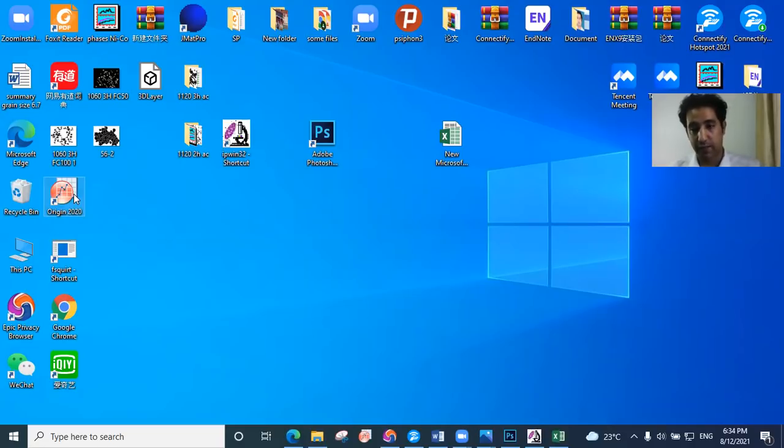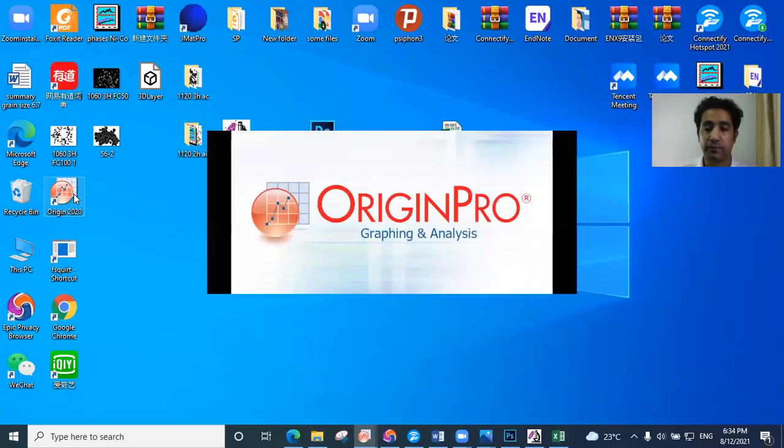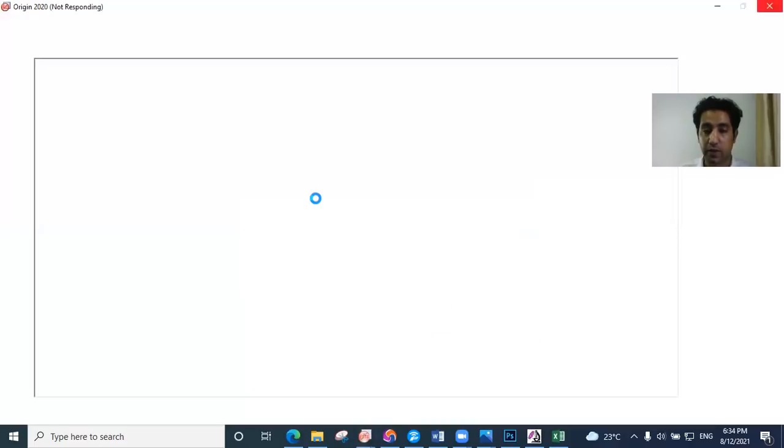It's a little long, but you can get correct results. When Origin is opened, just copy the data and paste it all right here.